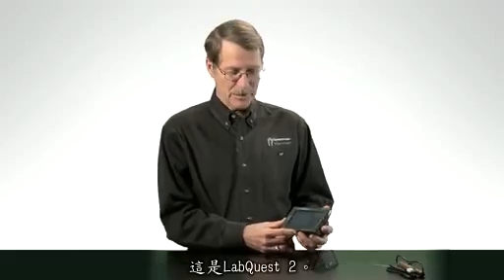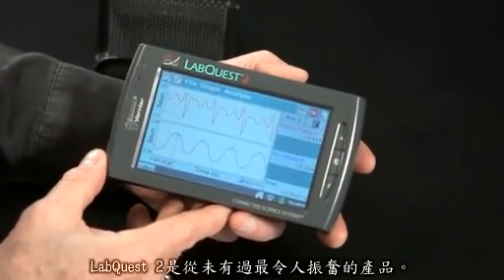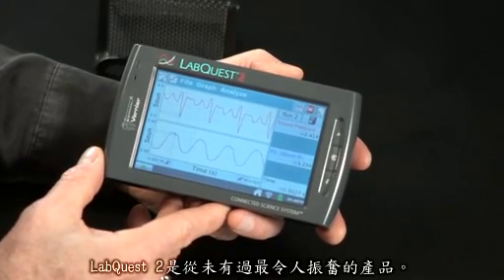Hi, I'm Dave Vernier, founder of Vernier Software and Technology. I'm here to show you something new and exciting. This is LabQuest 2. LabQuest 2 is the most exciting product we've had since our original LabQuest came out in 2007.